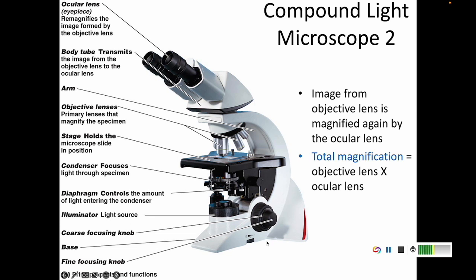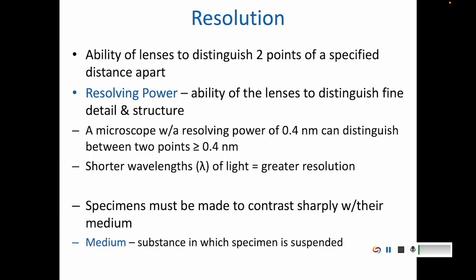Then the base here, this is the base of the whole thing, where it's sitting. Here's a little light control. On the other side, there's probably a light switch to turn the light on and off.